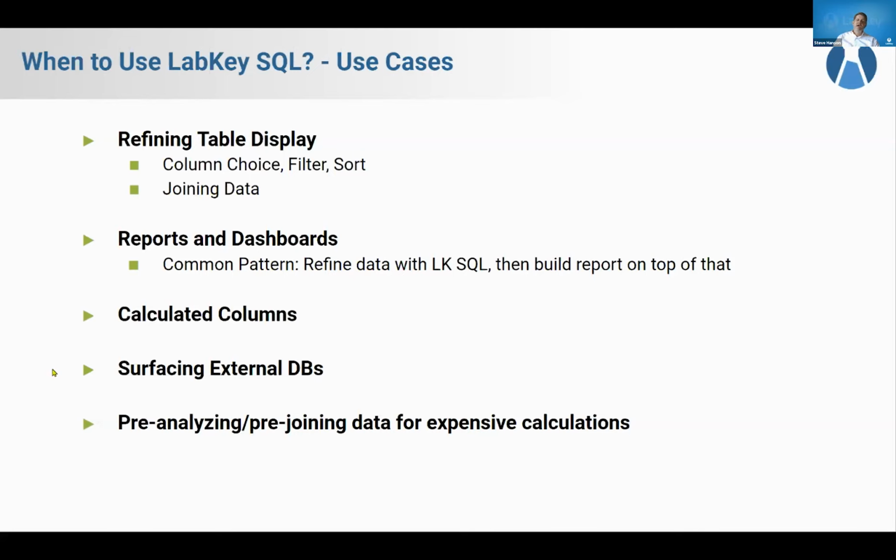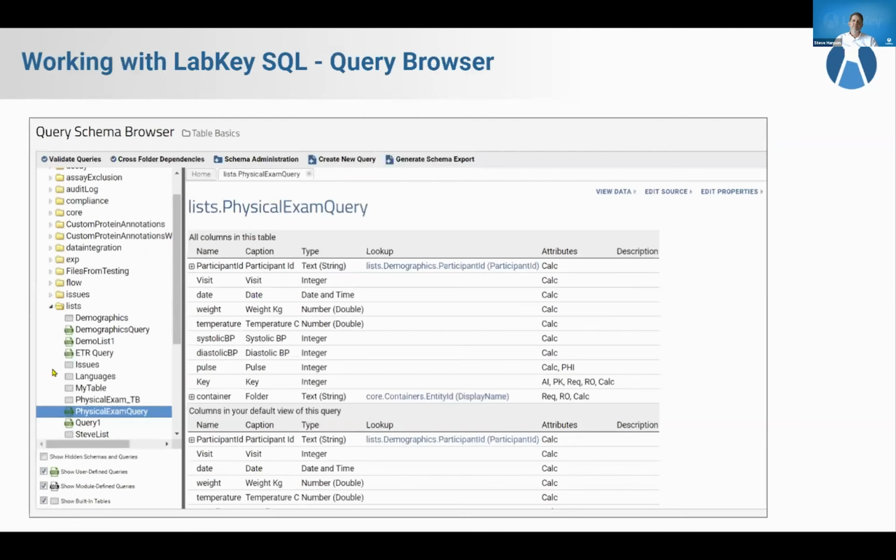you're off and running. And another great use case for LabKey SQL is when you need to pre-analyze or pre-join data when it's really expensive. Like you just have a lot of data, or you have a lot of processing to do, or a lot of complicated joins to do on the data. It can be really great to write that complicated query and, say, load it into a flat table, like a staging table, where you can then take that data and move it on to the next step. ETLs are a classic example of that. The ETL can go and grab all this data from all these different places and just load it into a simple query for the next step in that data's journey.